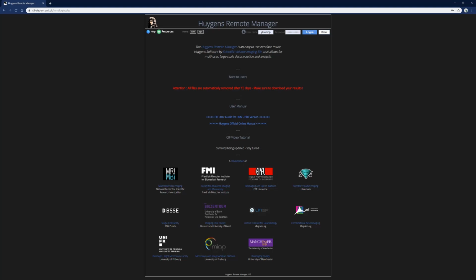So welcome to this short tutorial on how to use the Huygens Remote Manager at the CIF platform. Just as a prerequisite, in order to work correctly with this software, you will want to use Google Chrome as a web browser to avoid problems further down the line where you might not see your files, for instance, and errors like that. So make sure you are using Google Chrome first.